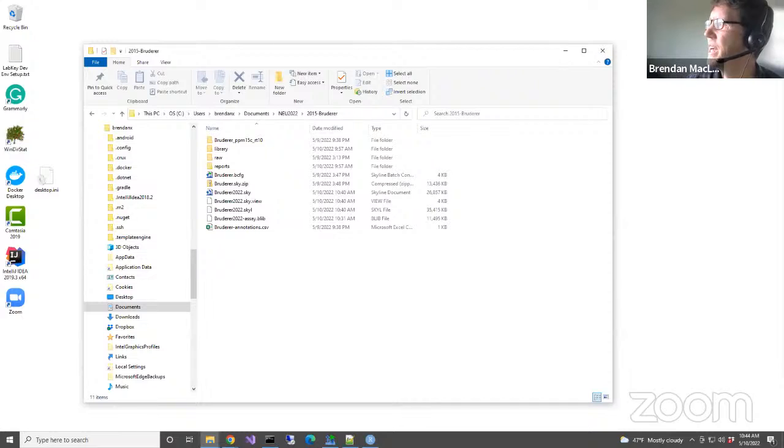People in our lab measure DIA product ions in profile mode. Is this in any way beneficial, or is centroided sufficient? Yeah, that's a good question. At the McCoss lab, if you're using an Orbitrap, we no longer even really save the profile data. If you acquire in profile mode on an Orbitrap, then the raw data file contains both the centroids and the profile data. And so our files are much smaller if we do only the centroided data, and we're not finding that the profile data is all that useful to us.